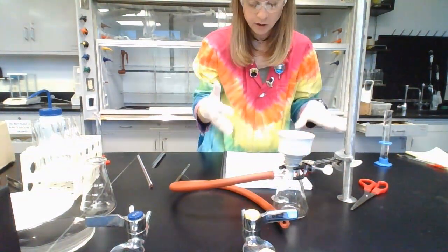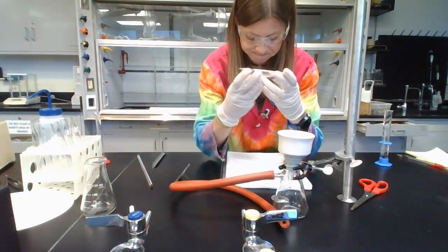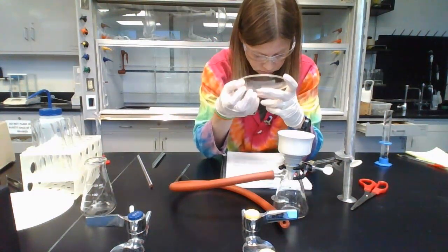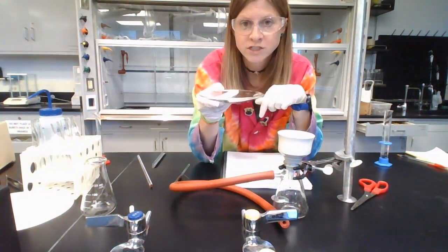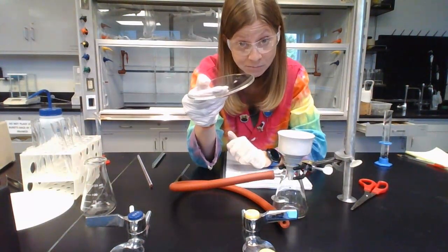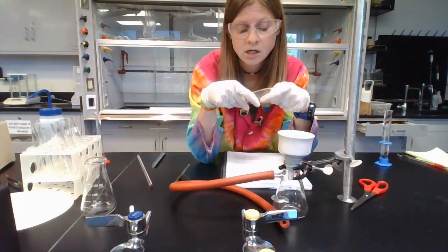While you're doing that, so the 5 minutes, what you want to do is get yourself, why can't I think of the name of this? Watch glass. It says a medium to large watch glass. And you want to go over to the balance. So while the 5 minutes is happening, you're going to go measure the mass of this while it's empty. And you're going to write your initials on it.